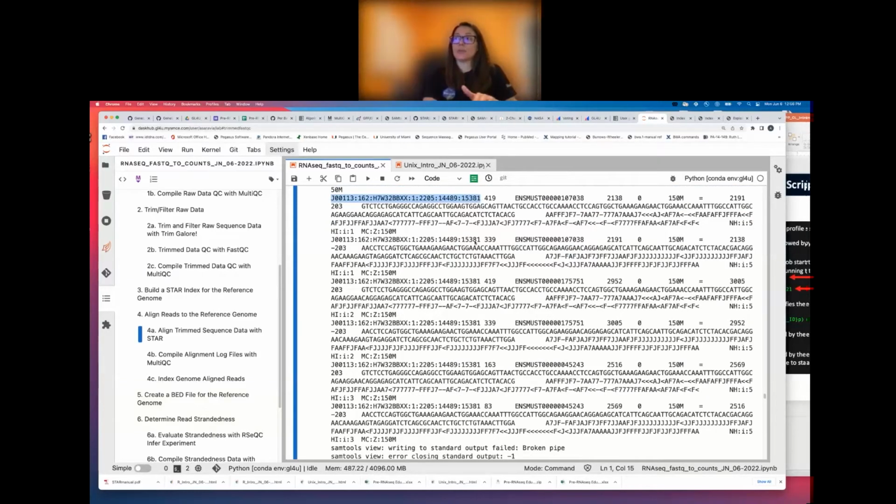We know because we see the same address for every one of these last 6 lines, and also the same template length, just one associated with a read in the positive direction relative to the reference and its mate associated with the reverse complement orientation. So same template, same address, just different sign. That's how we know that they're mate pairs.